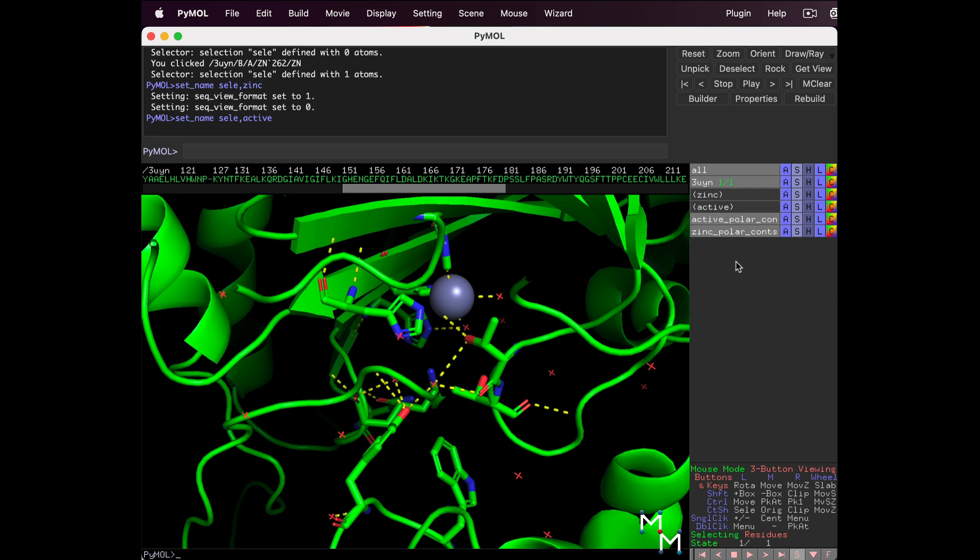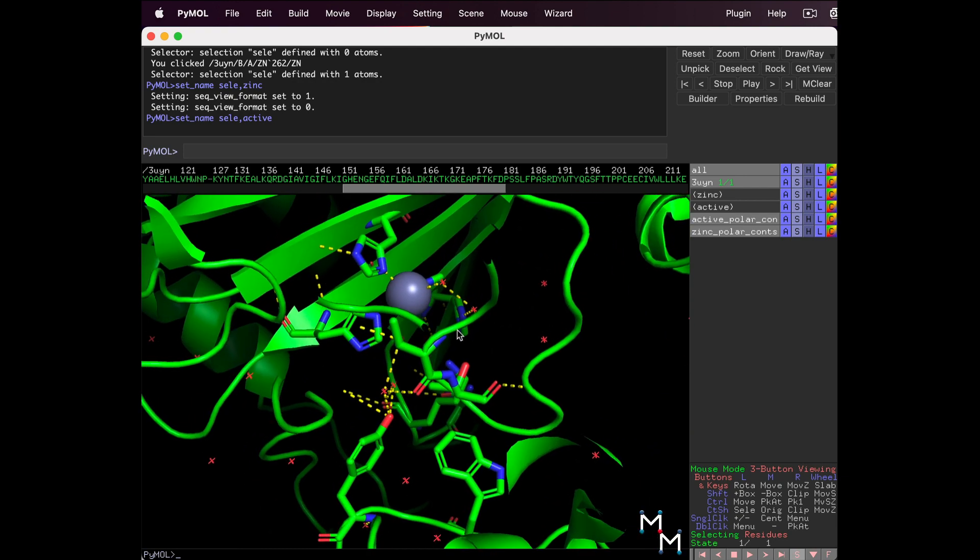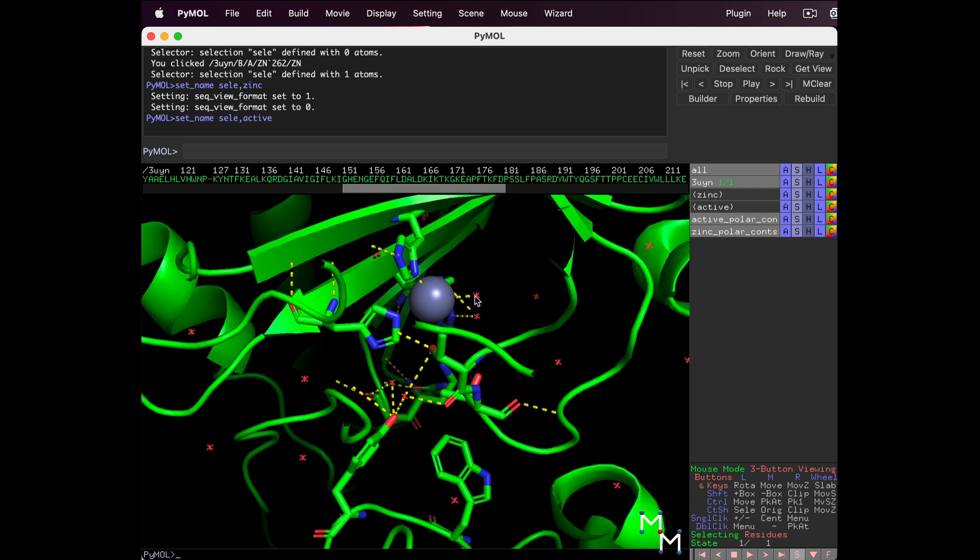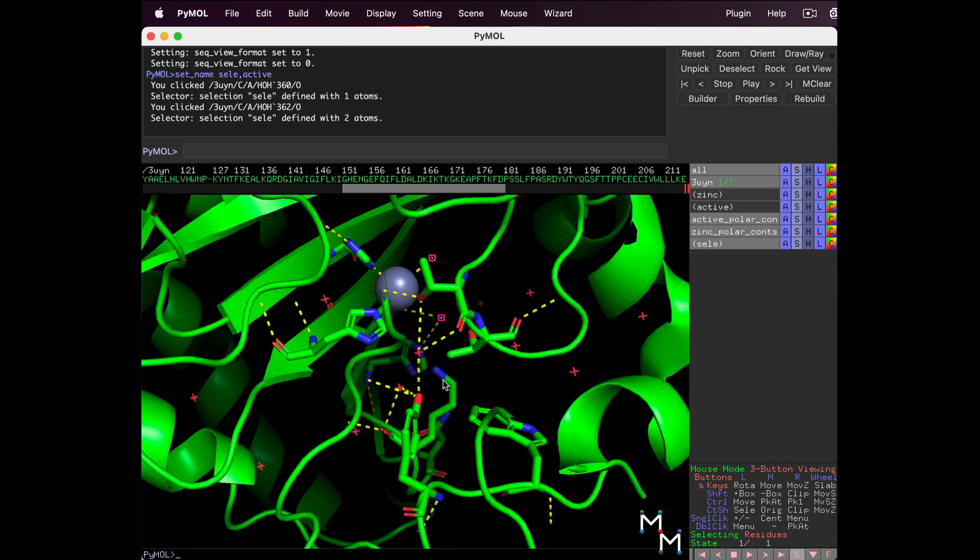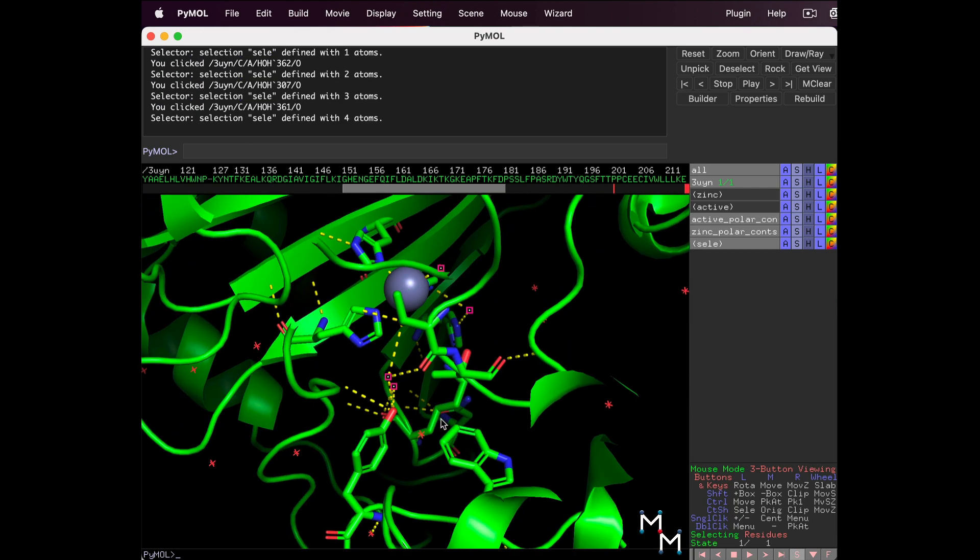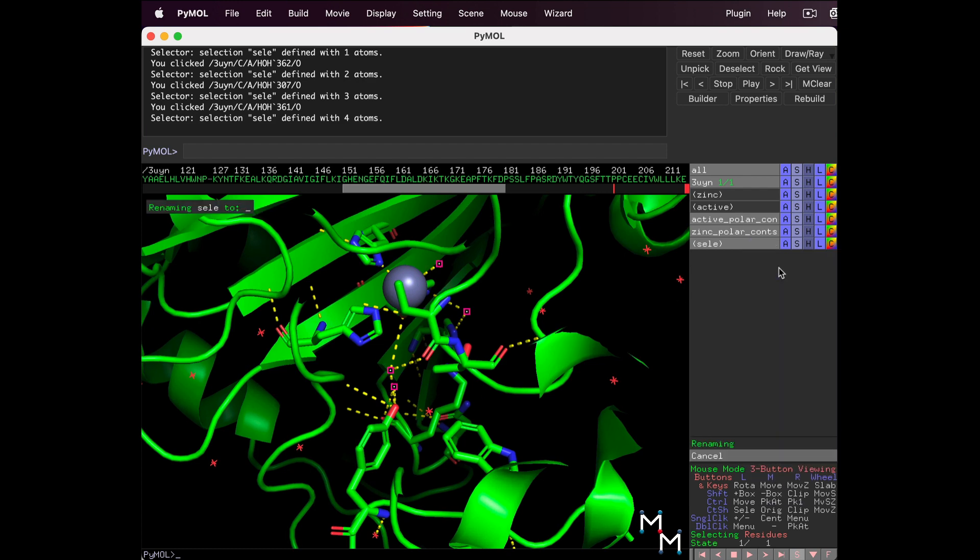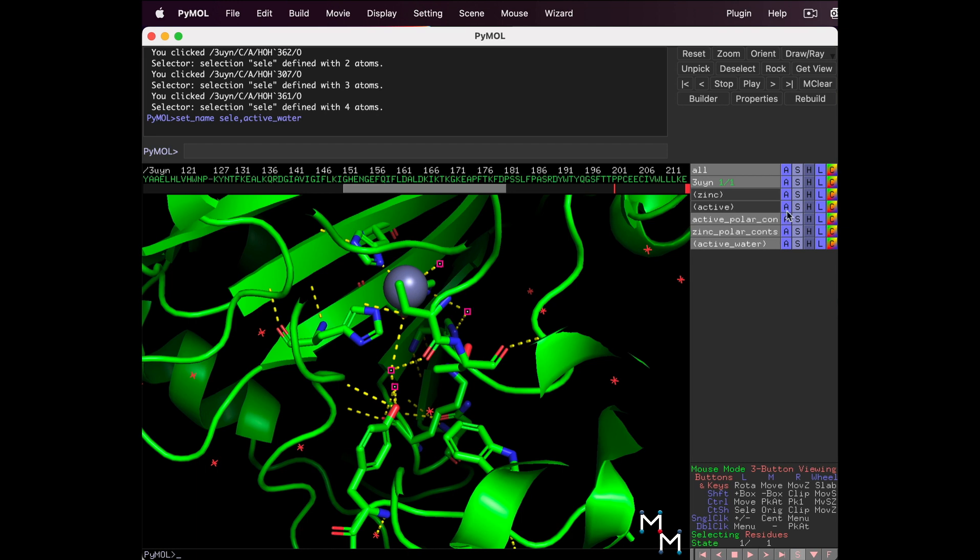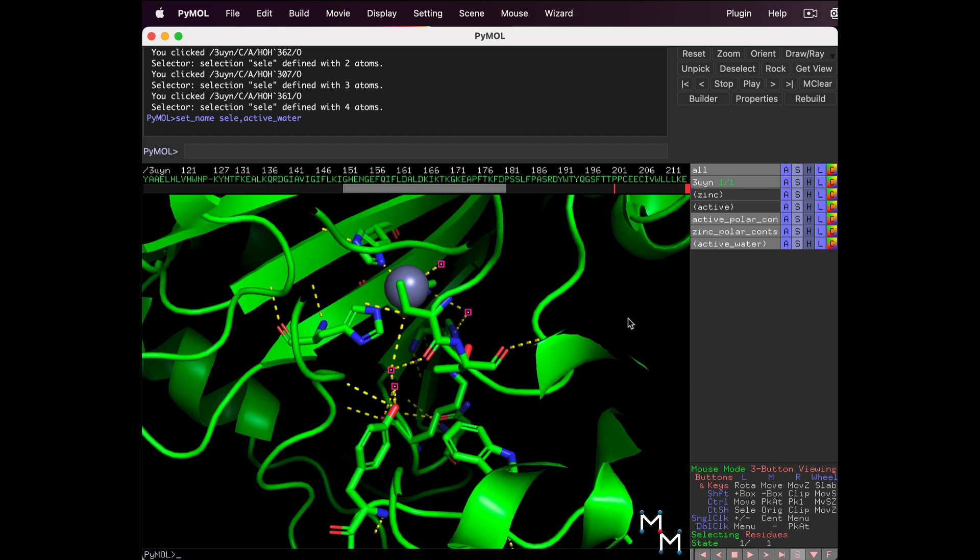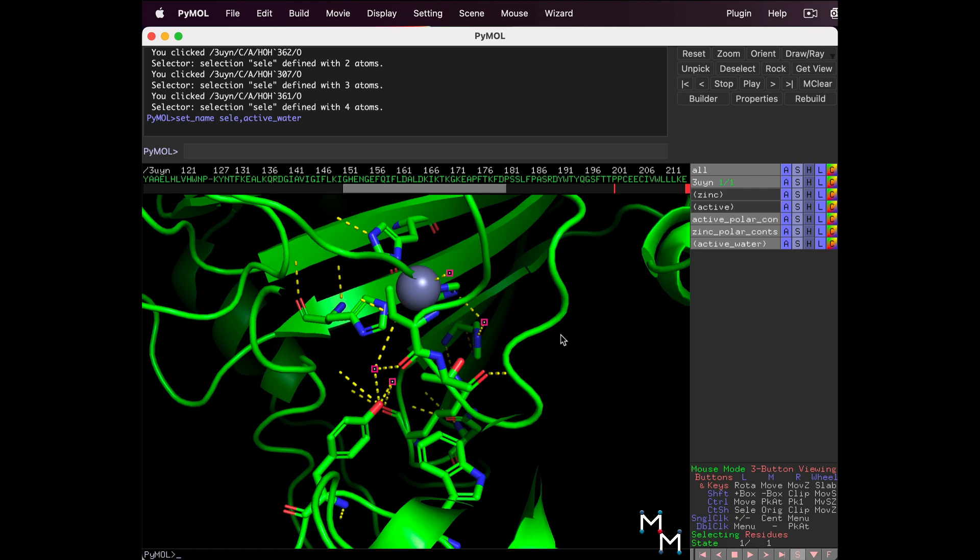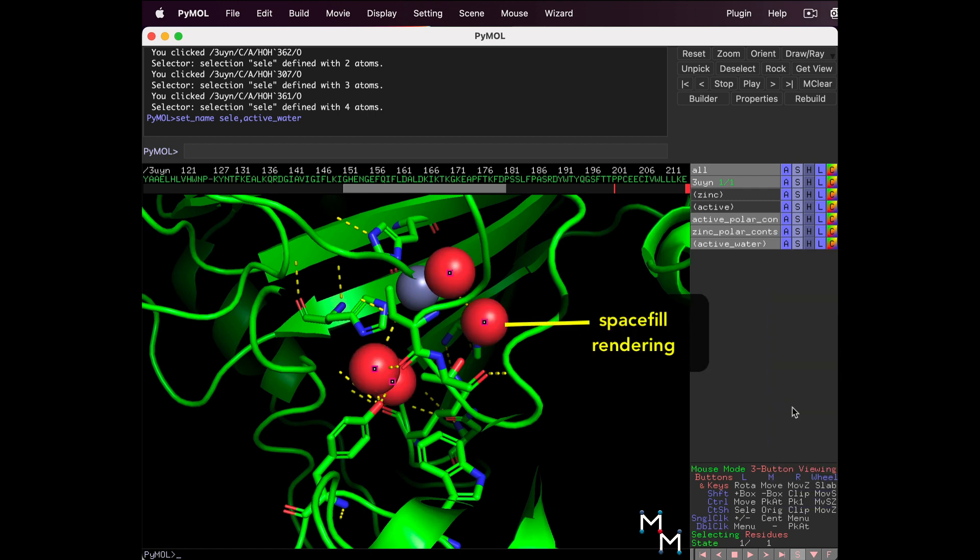Notice some water molecules have interactions with the Active Site Amino Acid Residues and Zinc. Let's select them by clicking on them in the structure. Rotate and zoom as needed to find them all. Now, save this selection. A, Rename, Delete S-E-L-E, and let's call this Active Water. Now we'll hide the rest of the water in the structure. Next to 3uyn, click the Hide button, H, Waters. But we do want to show waters in the Active Site. Next to Active Water, S, Spheres. This applies a rendering called Space Fill.